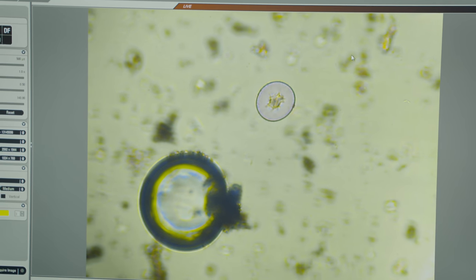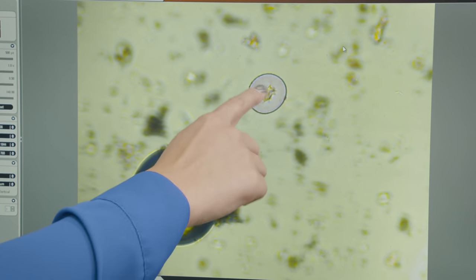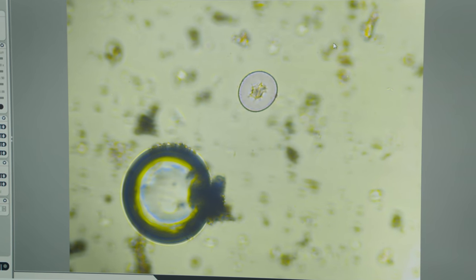Here's one—this is actually cedar. It's got a little bit of a star in the middle, like a distorted star.